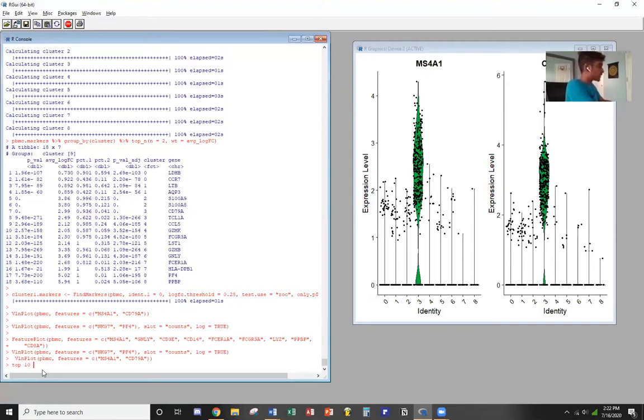So we'll be doing the top 10. And if you don't remember what that does, please refer to my earlier tutorial, our earlier part 2. So it'll be percentage sign, like this. Actually, there should be no spaces.